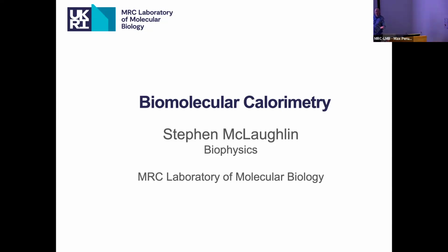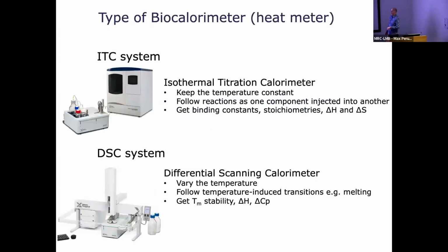And today you are the very lucky people, because we're going to talk about a biophysical technique that's universal, something that could be used for everything. So in the LMB, we're very blessed again to have two types of calorimeter where we're going to be able to measure the heat of processes.